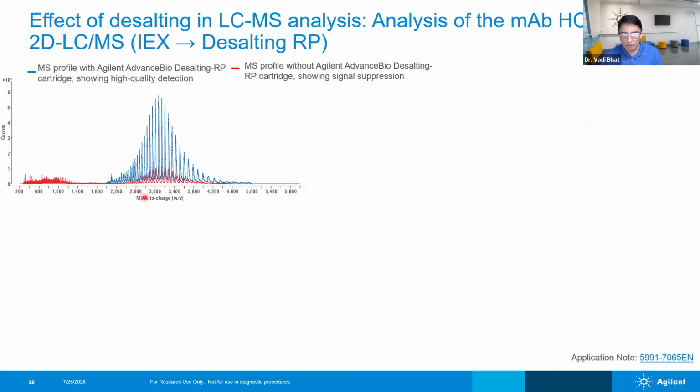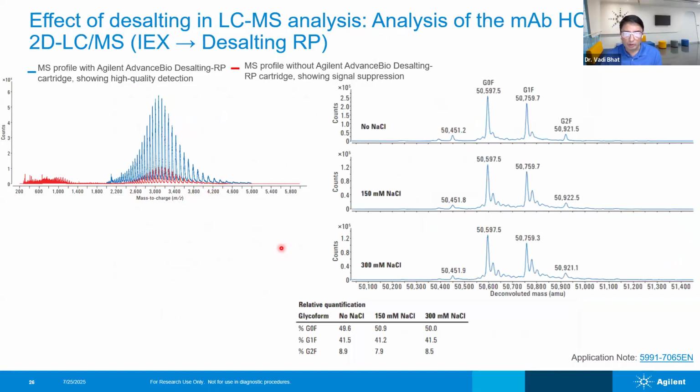If you don't desalt your samples, then you will see the data like the red trace here, the MS chromatogram, right? If you desalt, you'll see the blue trace, the spectrum. So essentially, what you have to do is manually desalt your samples to get the blue trace. It's a lot of work, and manual data correlation has to be done, right? So a lot of work.